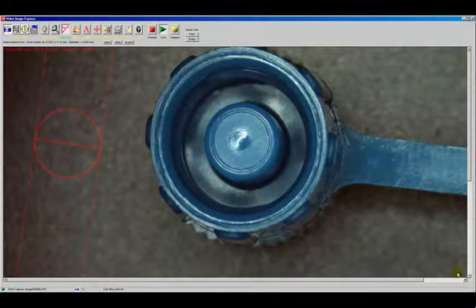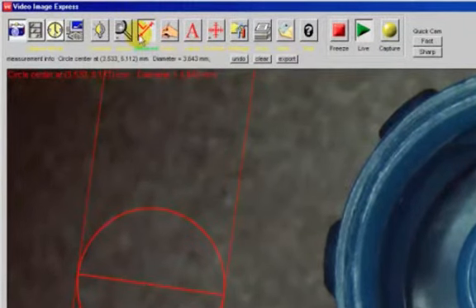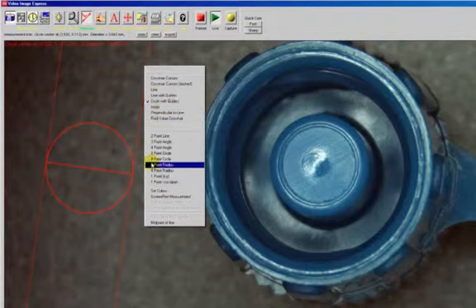Now we're going to show you how to change the colors of the crosshairs as well as change the pixel size and the font size of the diameters that are shown in measurement sequences. So at first you'll notice with this measurement tool, since we have measure depressed, we can right click again and hold down the measurement menu.